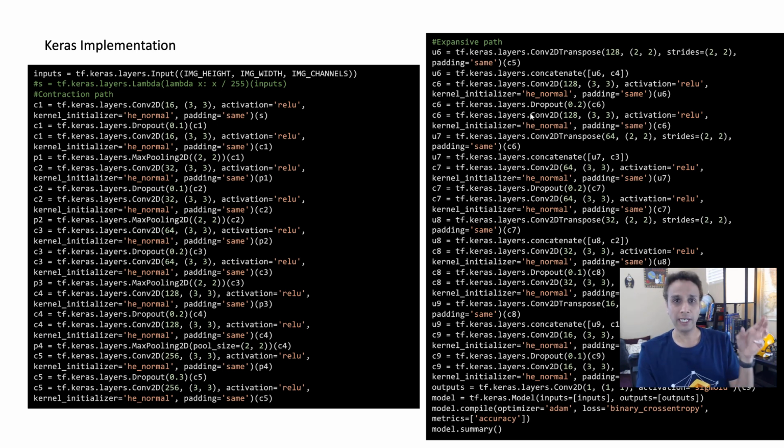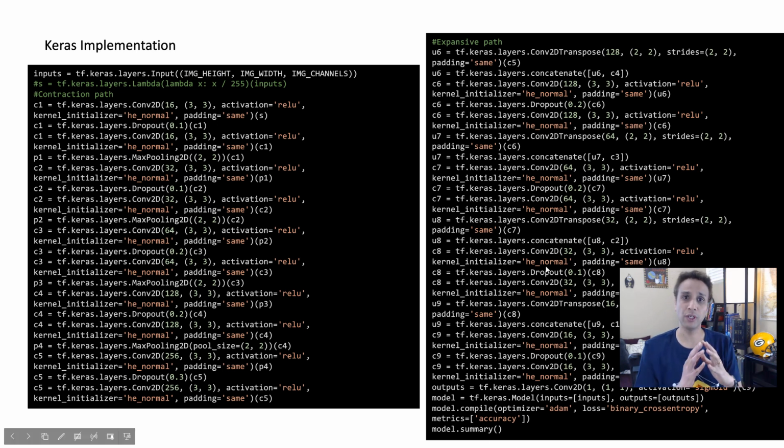So you kind of concatenate this information. You try this a couple of times, you'll get a hang of it. Now, if you really would like to use this for your own, let's say, different size images, if you have 128 by 128 images for training, just change this image height, width, and image channel, and it should actually work. Okay, go ahead and print out the model summary to make sure everything makes sense, and we'll do that in a minute.